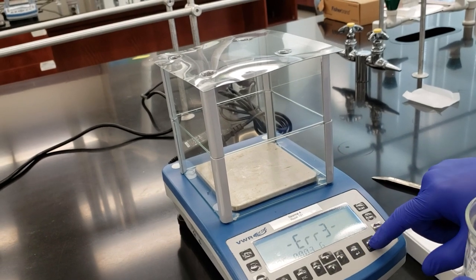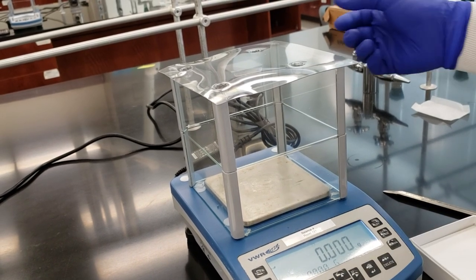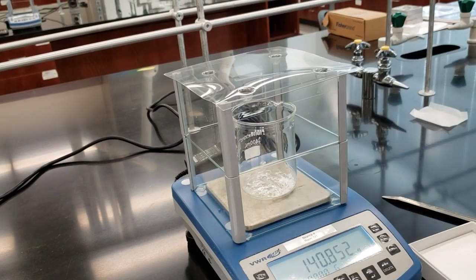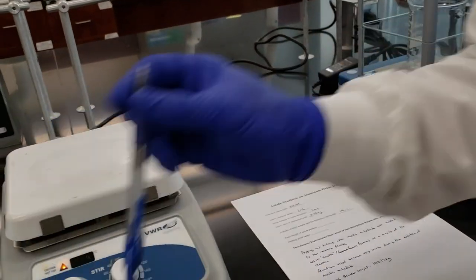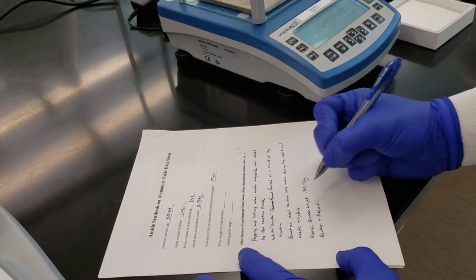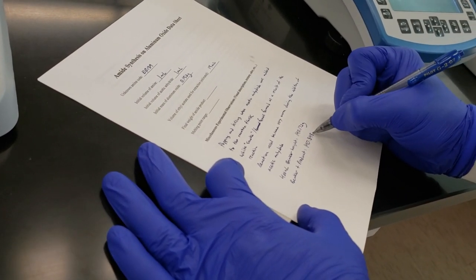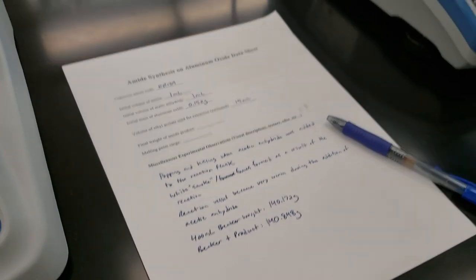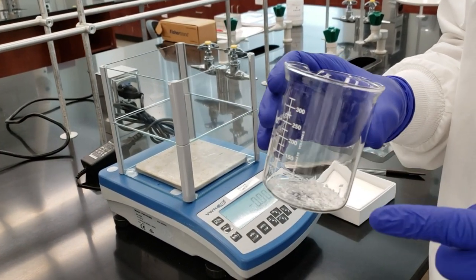I'm going to tare the scale. It's going to give us an error code here, of course. There we go. So 140.851. So this is our beaker plus our product is 140. We'll check back on it here as we're looking. 140.848. Changed a little bit as we were talking there. So we've got our final weight of our beaker and our product. Now let's take our crystals over to the IR, and we're going to characterize it using IR, then we're going to take it over to the proton NMR and get a spectrum.